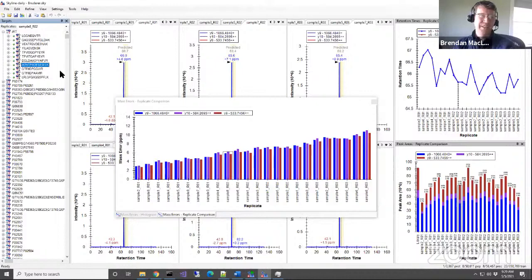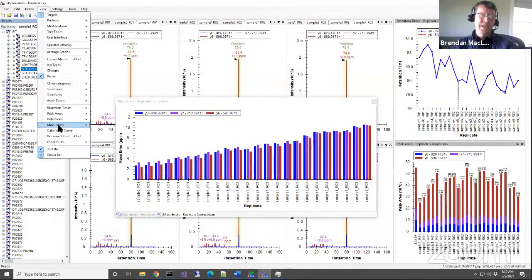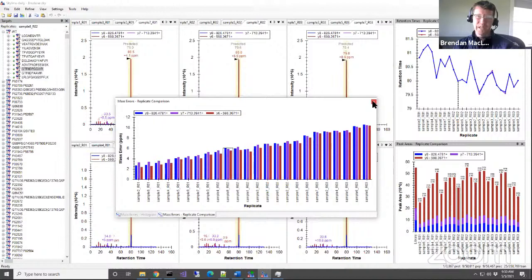So anyway, there are enough mass errors. All of these different things have various plots that you can look at, and mass errors can be pretty rich. And thanks for the questions to guide us to look at certain things.